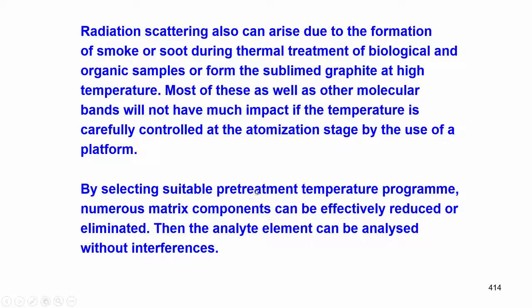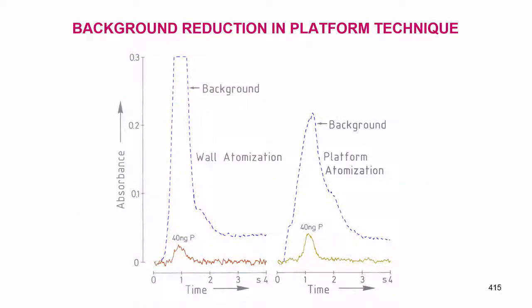By selecting a suitable pre-treatment temperature program, numerous matrix components can be effectively reduced or eliminated. Then the analyte element can be analyzed without any interference, because we have removed most of the matrix components out of the system by pre-treatment. Okay.